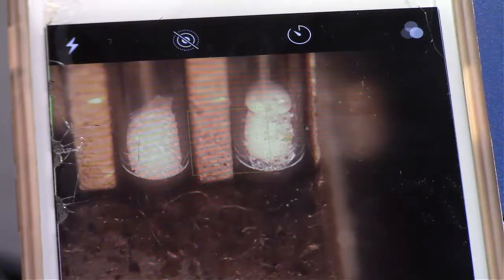You can see on the right, it looks like some of those crystals are getting a little bit more transparent, especially if you look at the bottom. You can almost start to see through them just a little bit. And then the one on the left, our melting point standard, looks like that sample is settling just a little bit. So everything's starting to settle a little bit more.